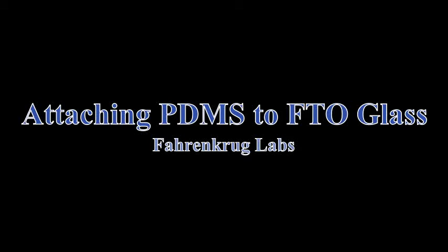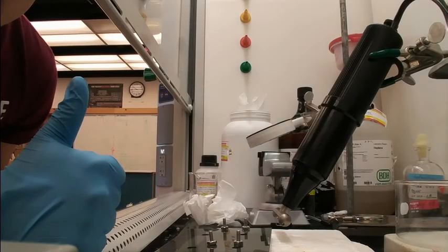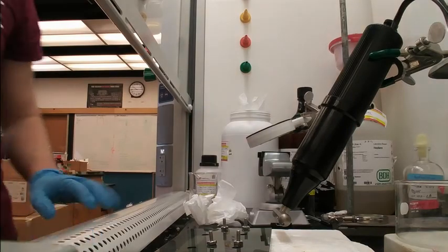In this tutorial, we will discuss how to attach the PDMS to the FTO glass using Corona Discharge.